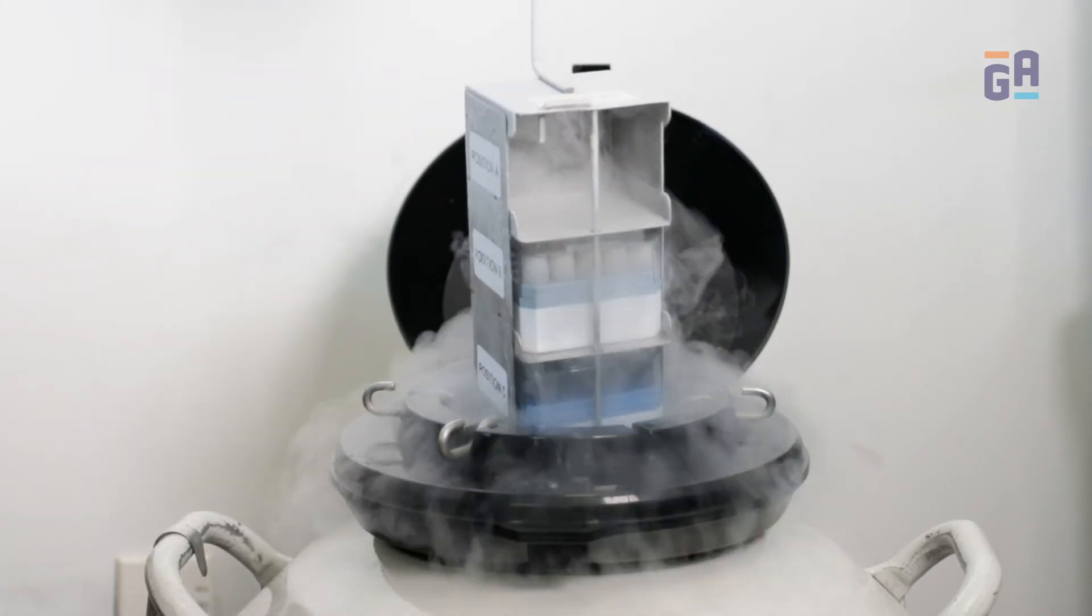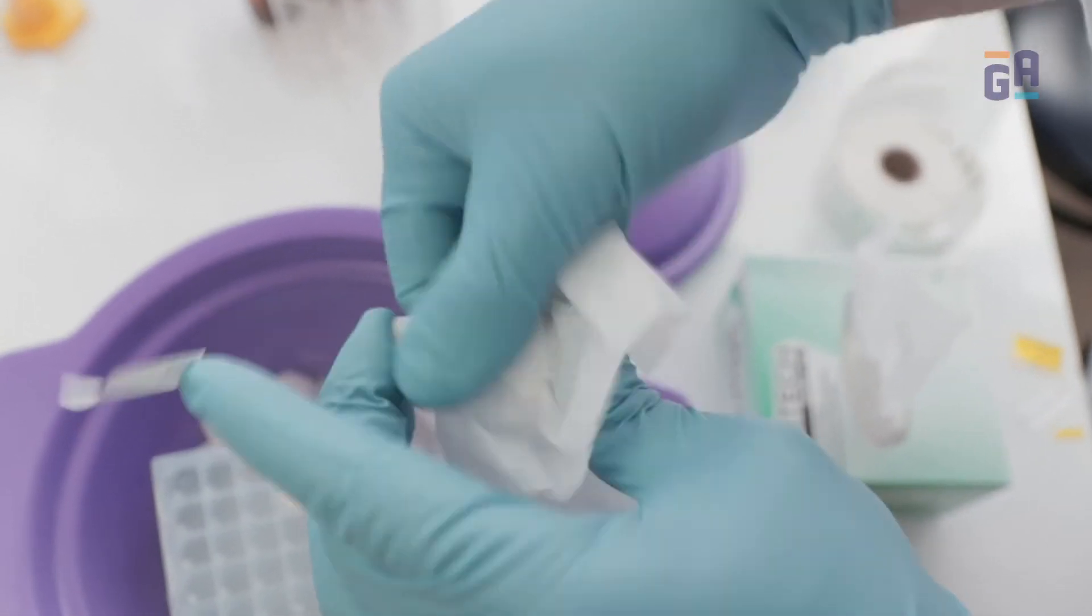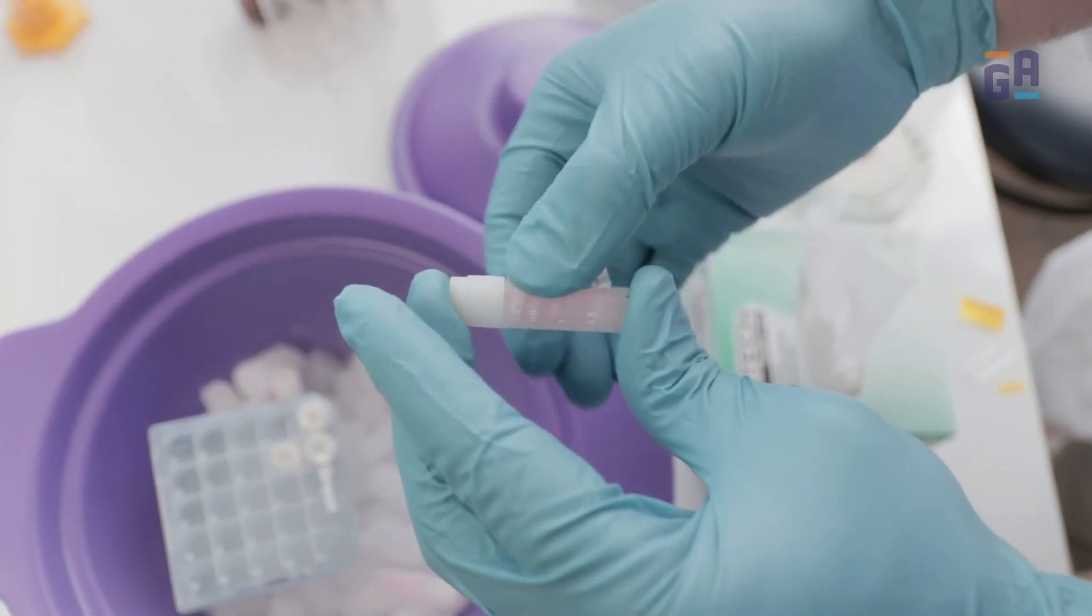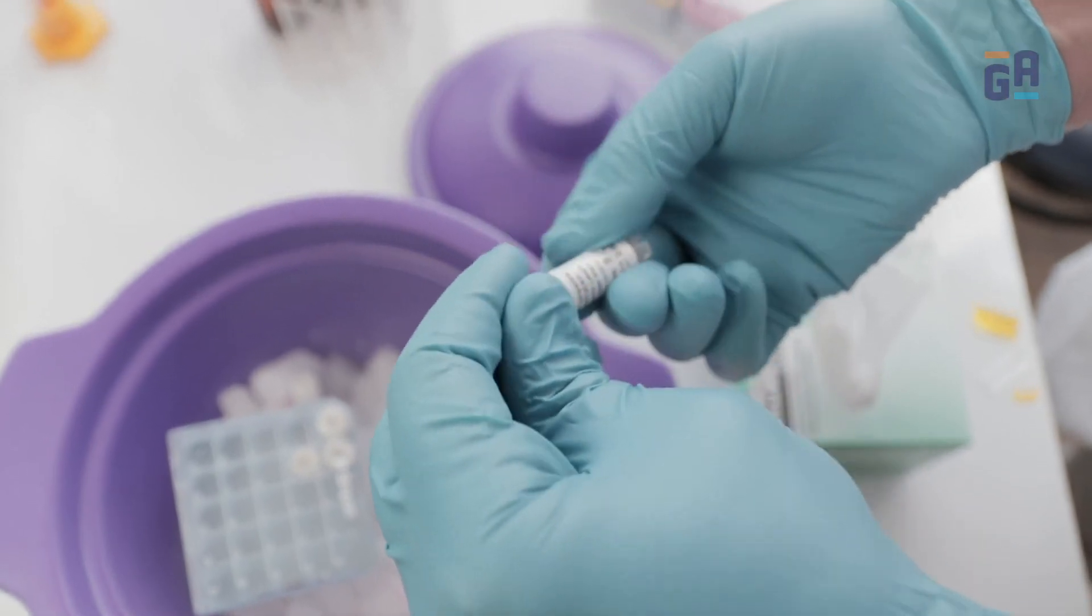Simply remove samples from liquid nitrogen or freezer. Place in dry ice for five minutes. Wipe excess frost. Firmly anchor left edge of label and apply pressure while rolling the circumference of your container.